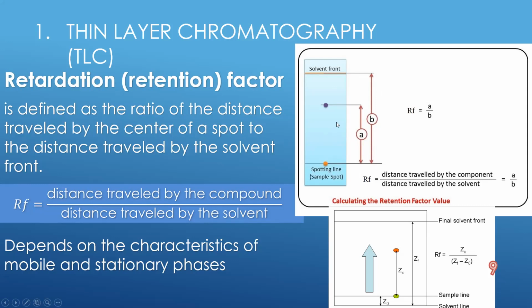And by this retardation factor, different substances can be identified. If they are seen in a mixture, you can place a spot, for example, of a clean substance, correlate the retardation factors for the clean substance and the substance in the mixture, and make an assumption whether the substance is the same. If it has the same retardation factor, then the substance usually is also the same.